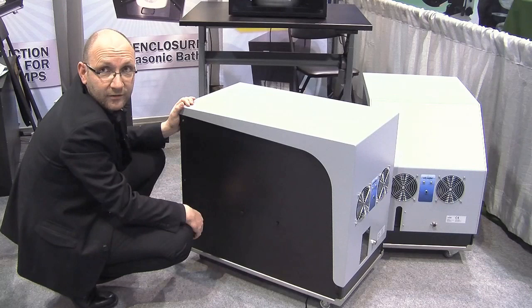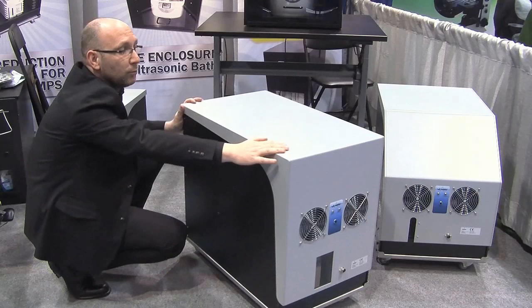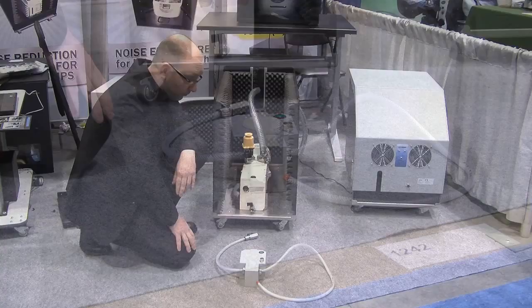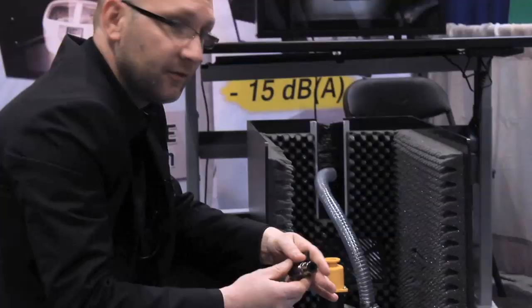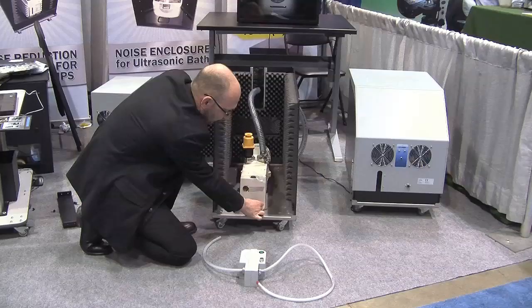Since the whole enclosure is on wheels, you can move the pump very easily. We also have a small additional feature: most of the time, changing the oil on a vacuum pump can be very complex because you need special tools. We can supply this small valve that you place and connect here, leaving it in place on the pump.